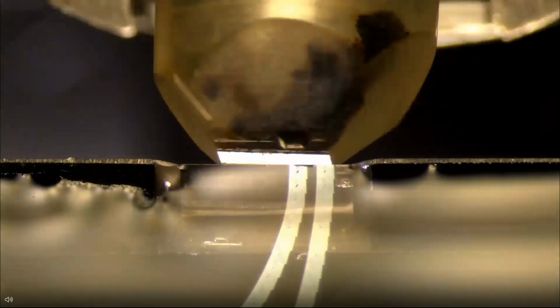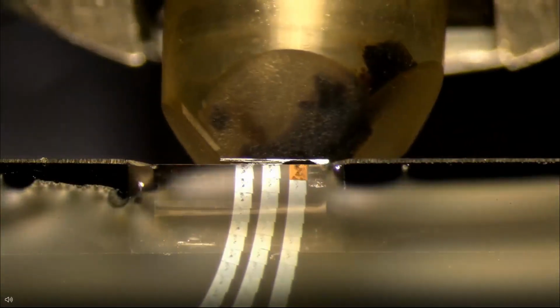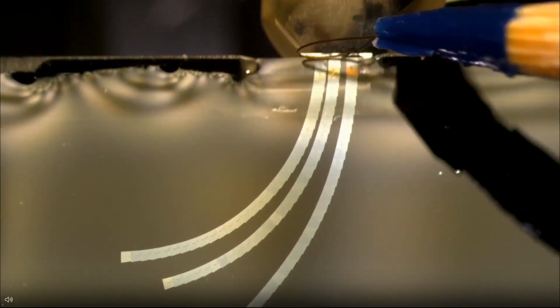Of course, this is sped up. First ribbon, second and third. And then after the third one is finished, the release cuts are done. Here in this case, we only took 2. Of course, we could push the ribbons onto the wafer, which you can see here below, but we wanted to save some of the material.